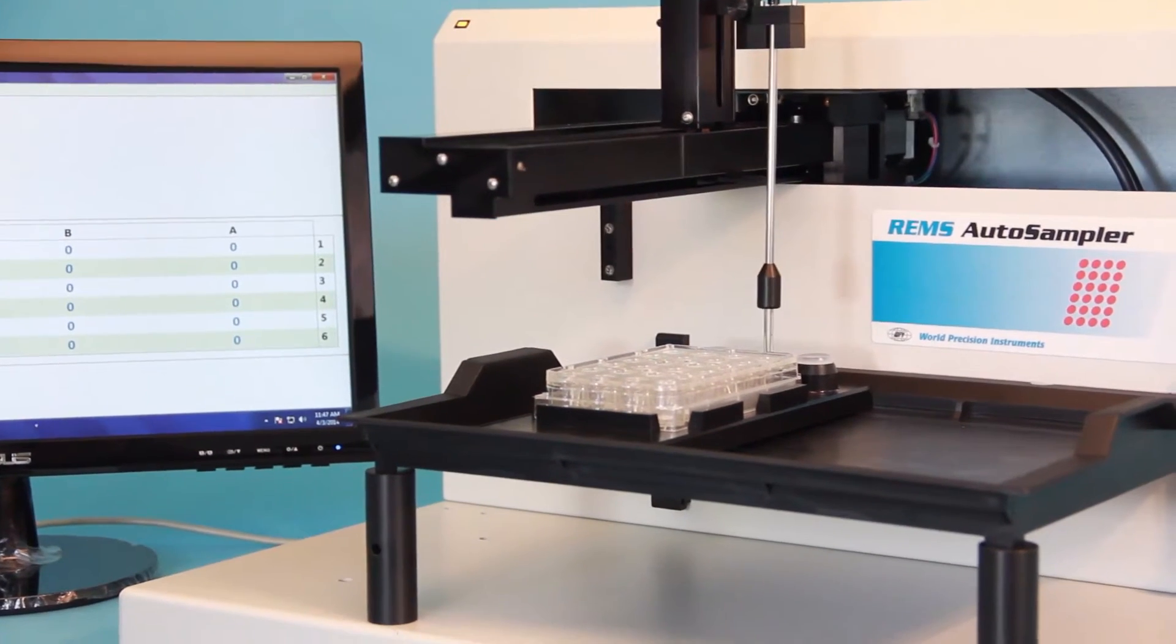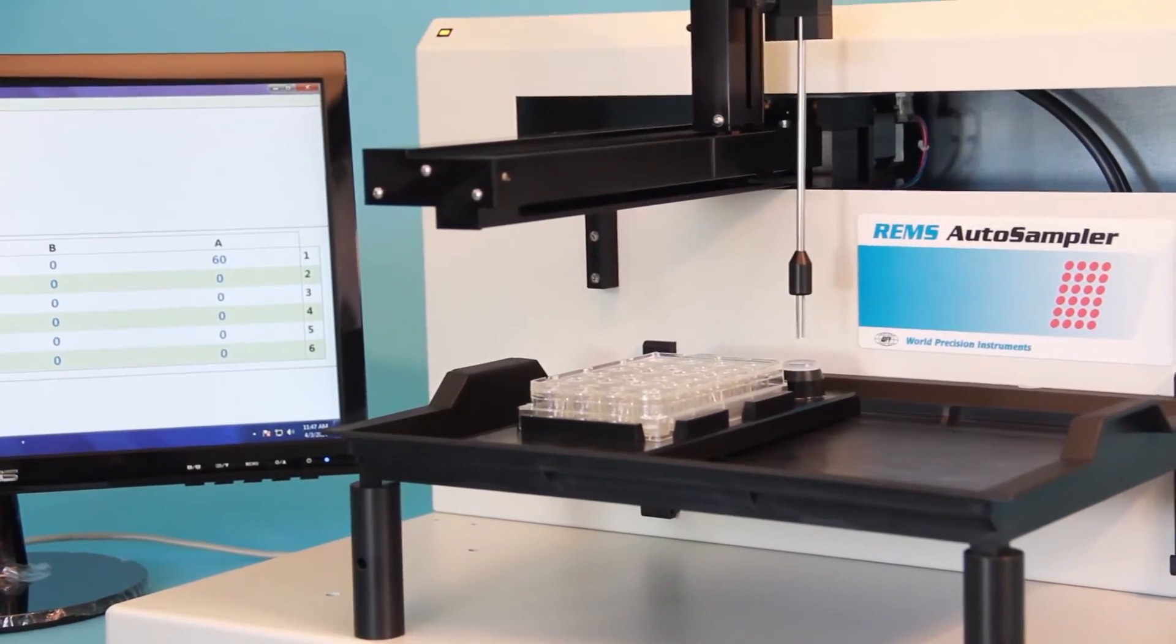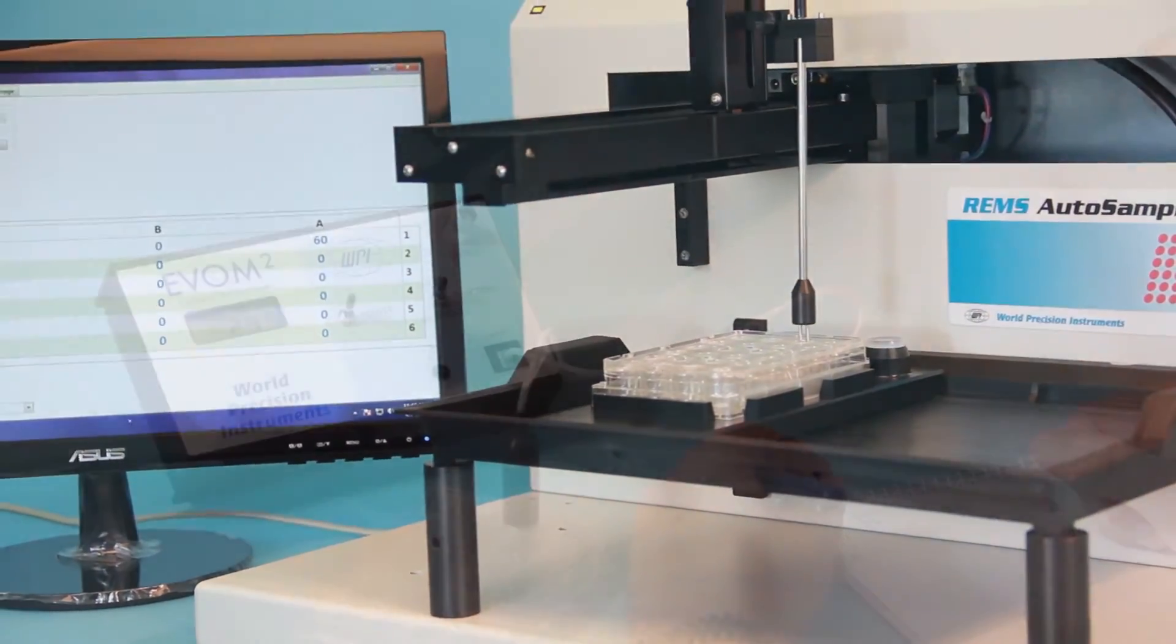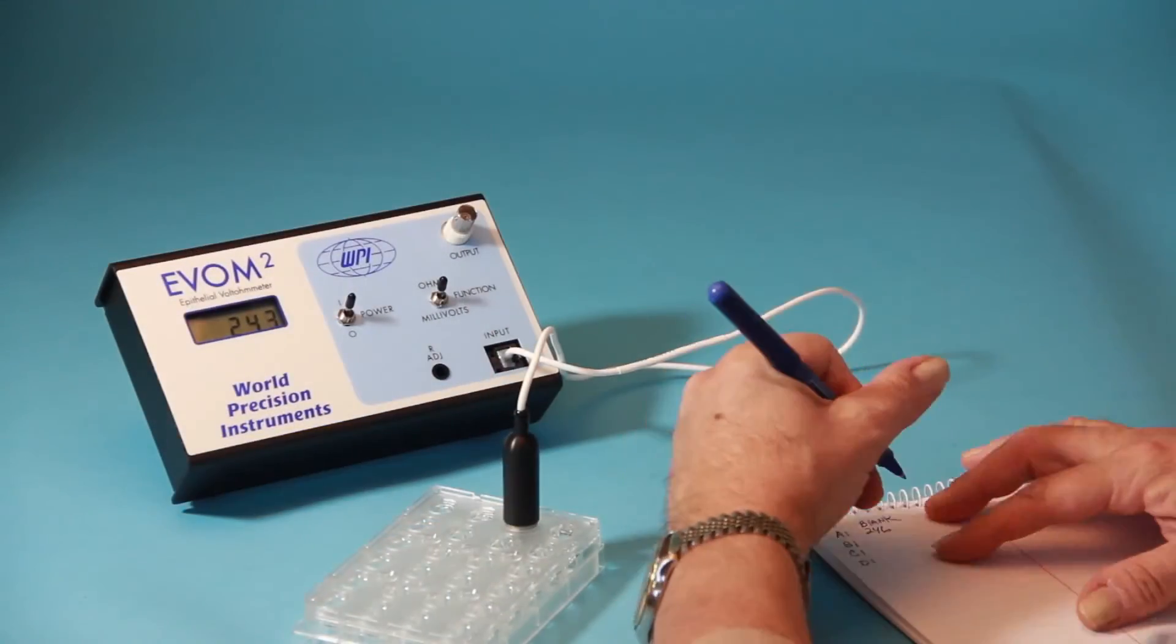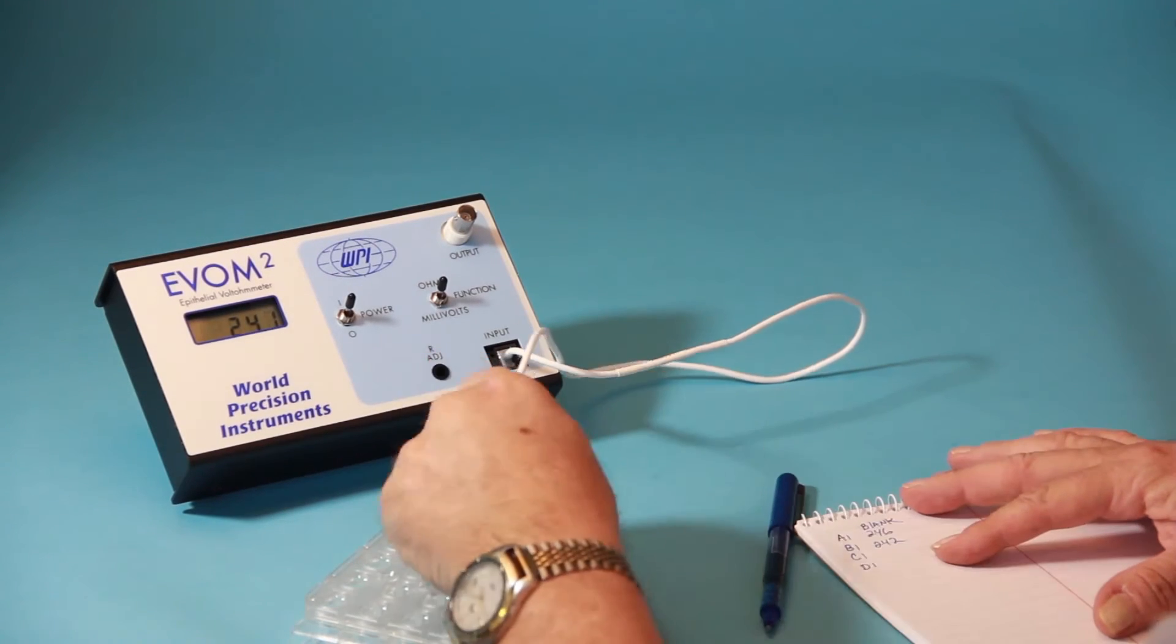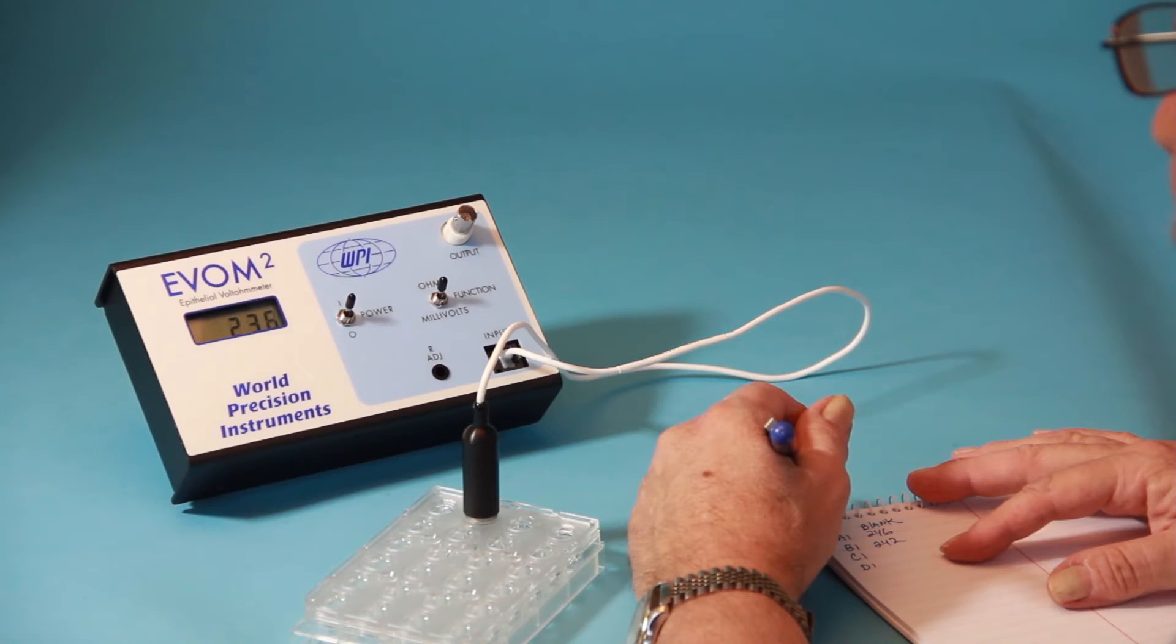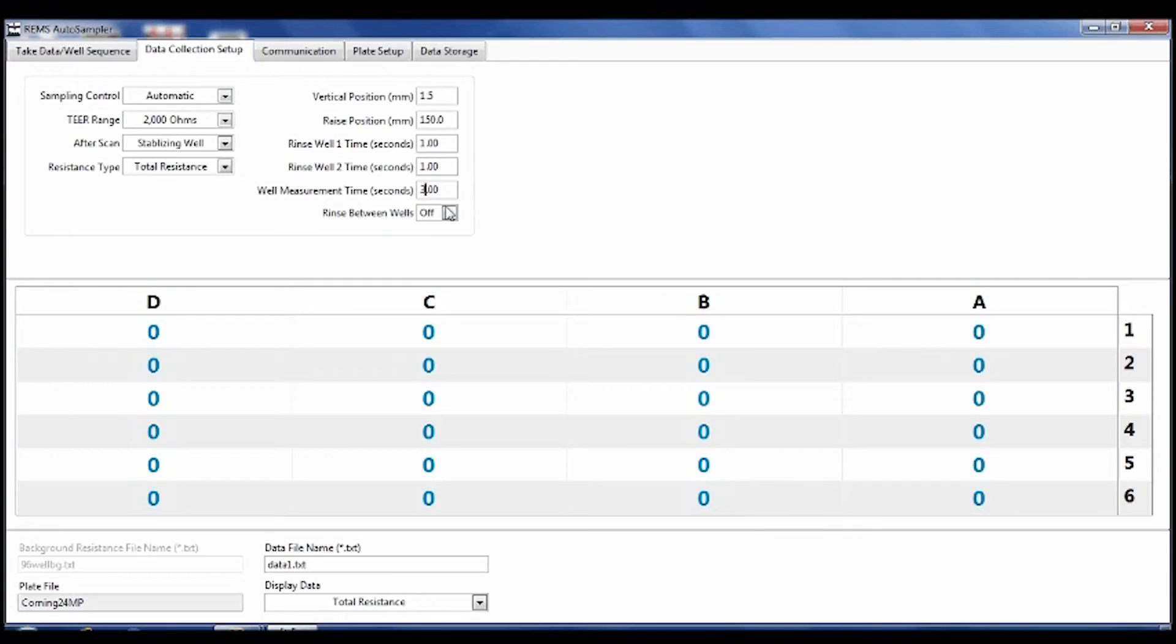WPI's REMS can record TEER for 96 wells in as little as five minutes. In addition to significant time savings, automated TEER sampling eliminates a common source of inaccuracy typically associated with variances in electrode placement during manual measurement taking.